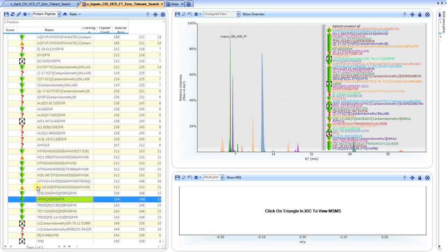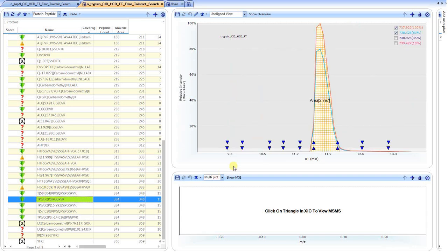In this case, we would start with the unmodified form of a peptide, and we'll just grab this particular peptide. When I click on it, it will change the chromatographic view from all possible peptides that were attributed to the protein sequence to the specific peptide as we've highlighted. And the triangles just simply represent MS2 events or spectra that are attributed to our precursor mass-to-charge value. If I click on any one of these or just hover over it, I can see that this is the +2 precursor charge state and was fragmented using CID. Or I have a +2 acquired in the HCD cell.